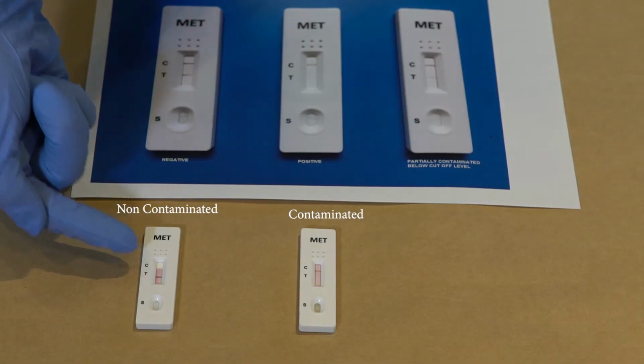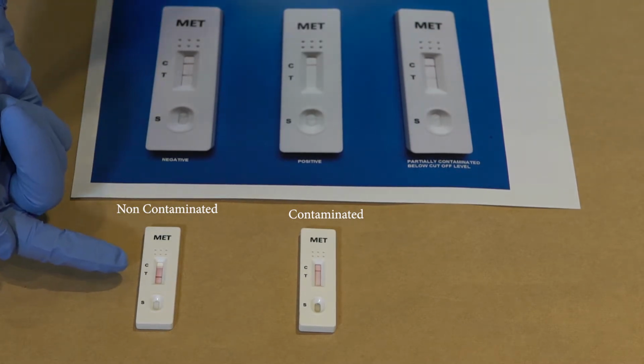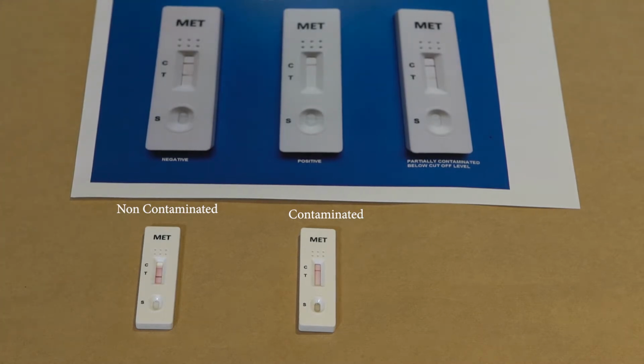A negative should have 2 dark lines. A positive will have 1. A partial will have the faint T line and the strong C line. As you can see, the negative is already coming up with a strong T line. However, the positive is showing the strong C line with no T line action at all.